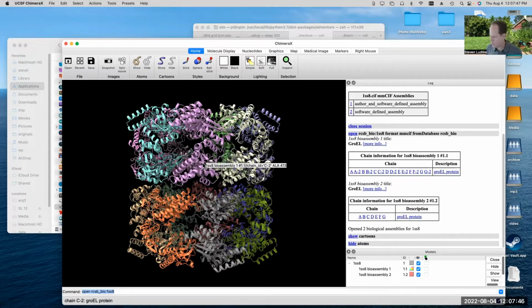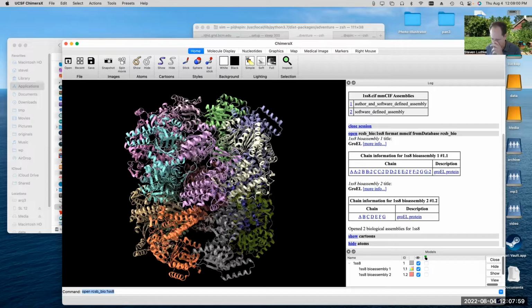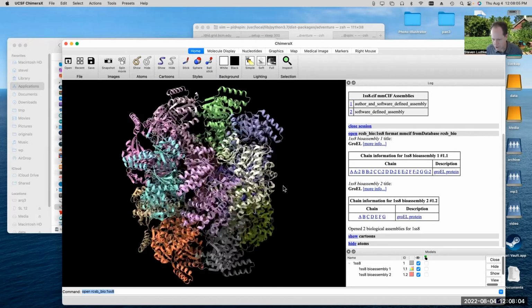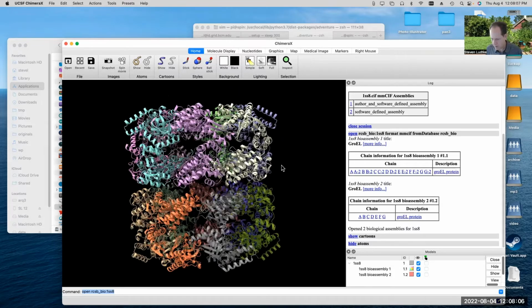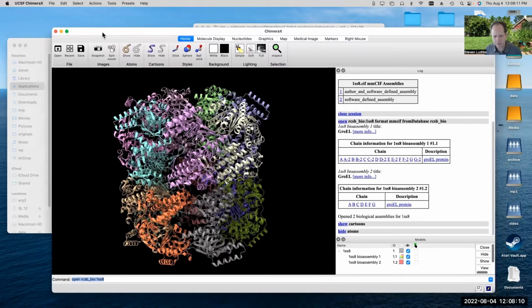It's a 14-mer, so moving one subunit or getting rid of and putting one subunit back represents less than 10% of the total volume. So it seems like a reasonable sort of test. And if we don't do it in adjacent subunits, then we'll be able to distinguish things a little bit better. So I think we'll go ahead and just pick one of them and extract that first.